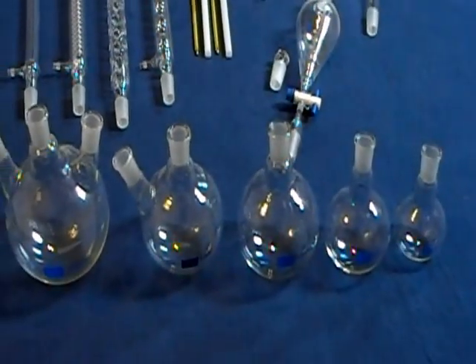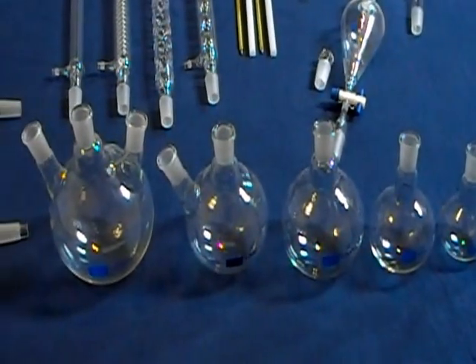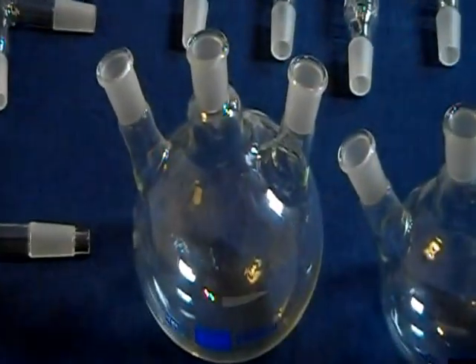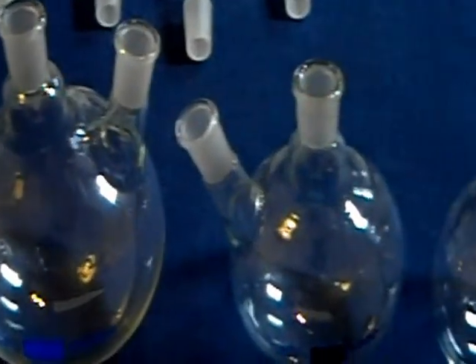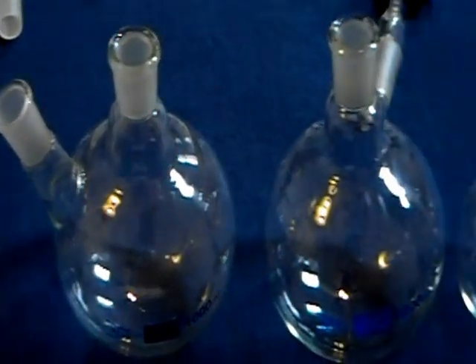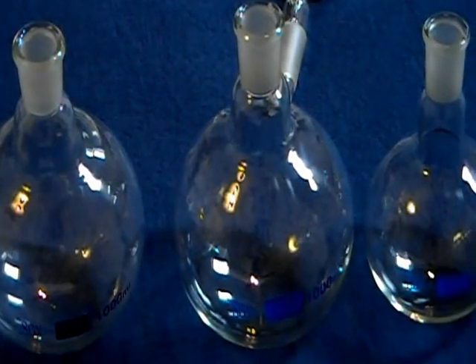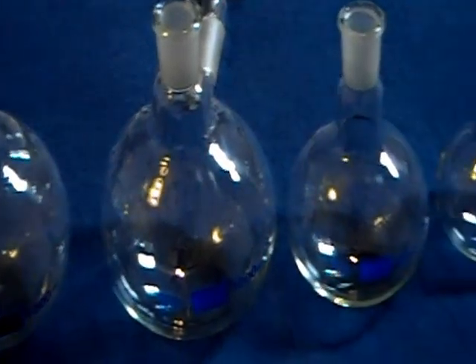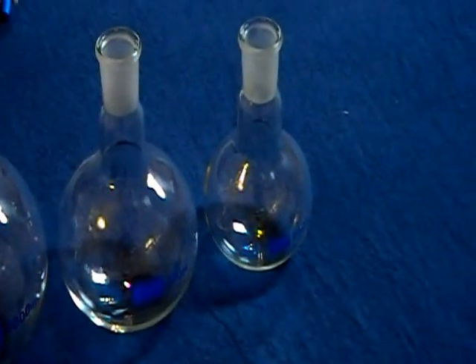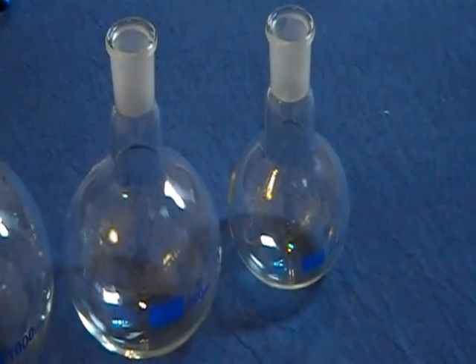In the family of round bottom flasks that come with this kit: a 3-neck 2,000mL, a 2-neck 1,000mL, a 1-neck 1,000mL, a 1-neck 500mL, and a 1-neck 250mL.